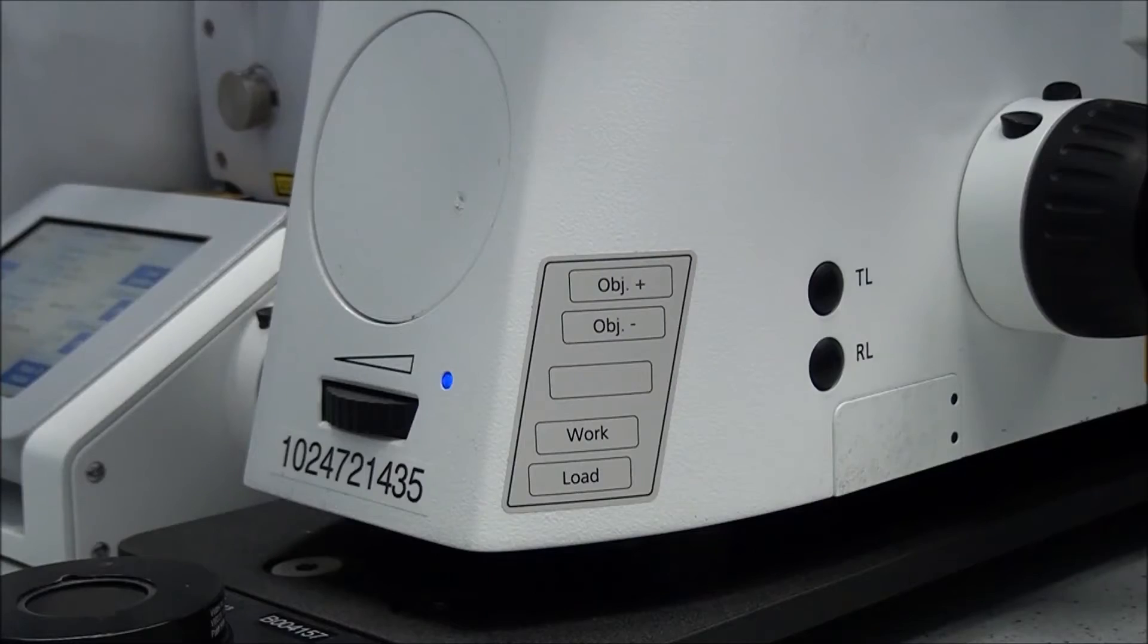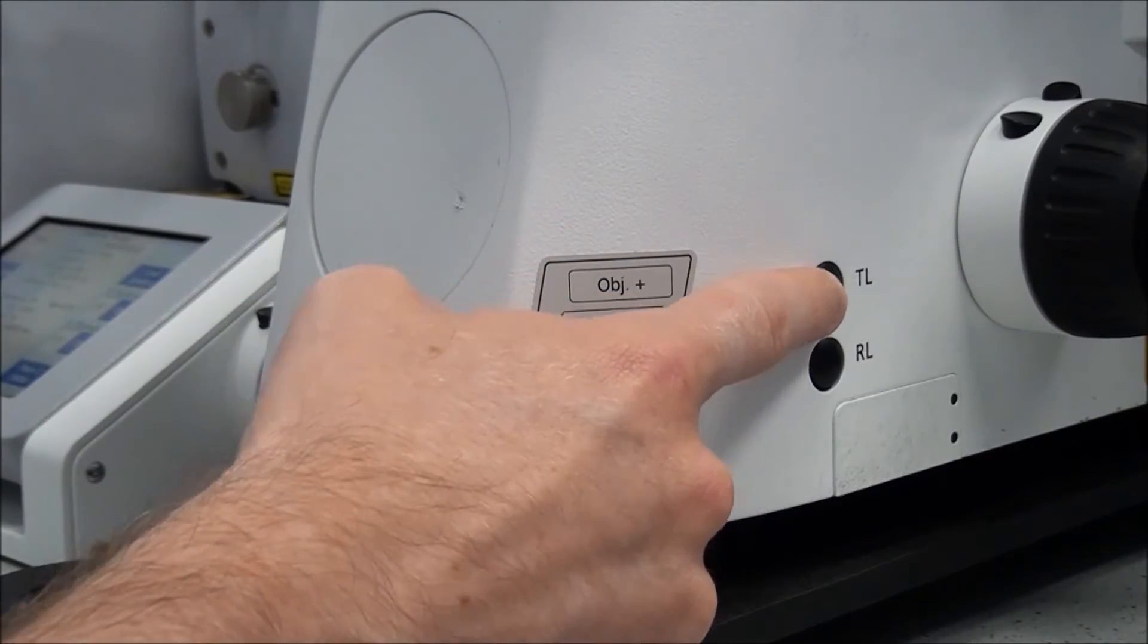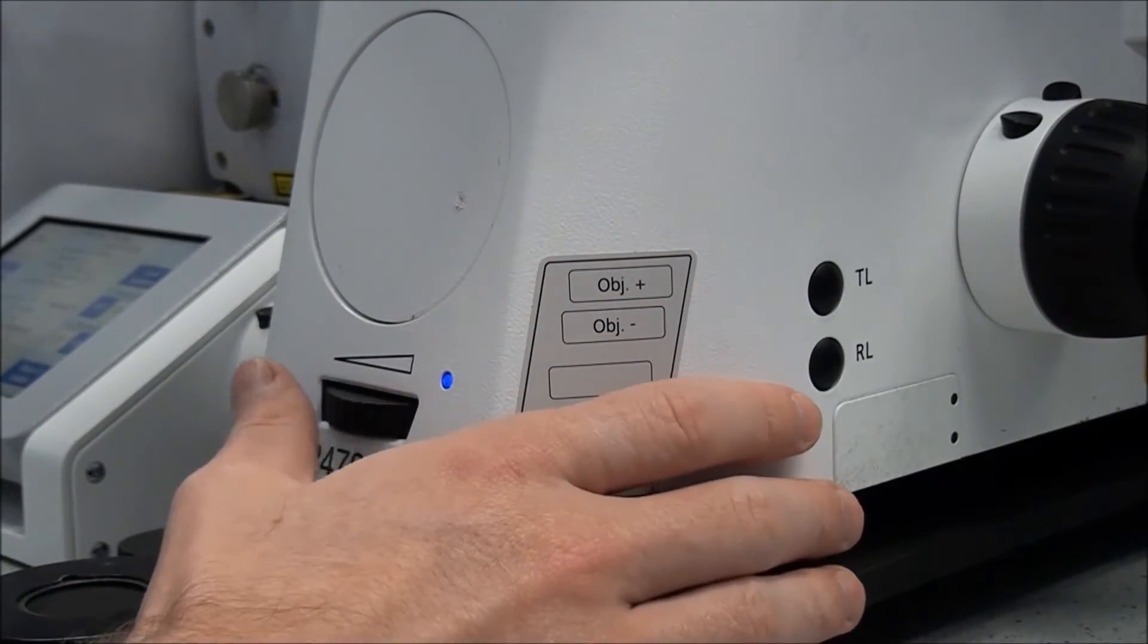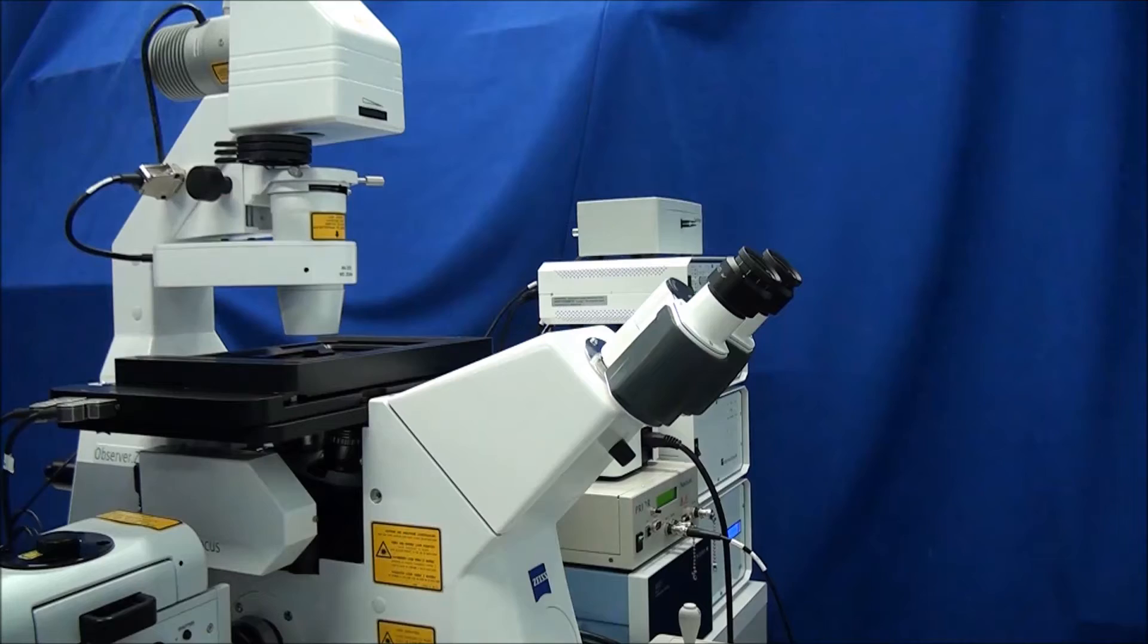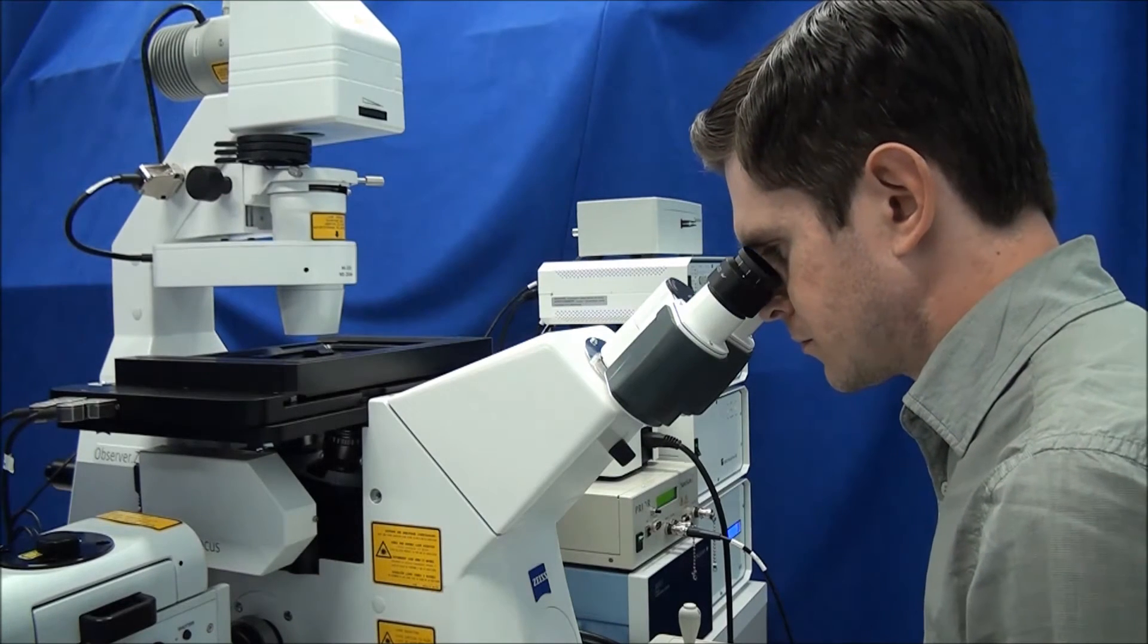If necessary, press the TL button to turn on the light or open the shutter. Turn up the transmitted light via the roll wheel on the front of the stand. You should be able to look comfortably through the eyepieces.